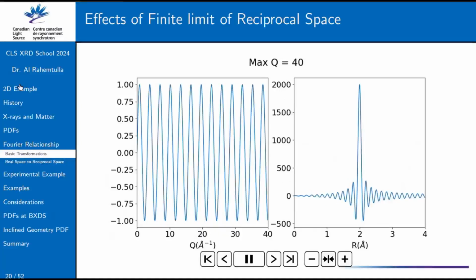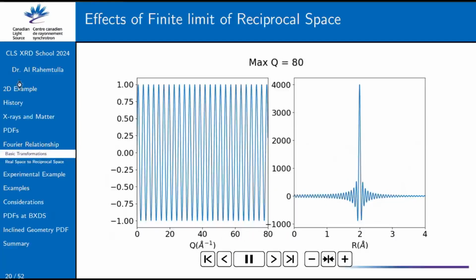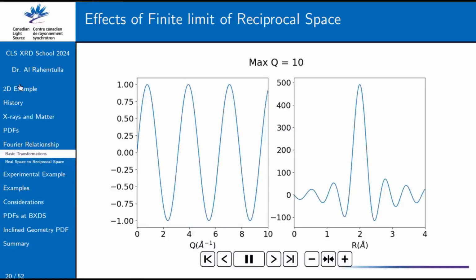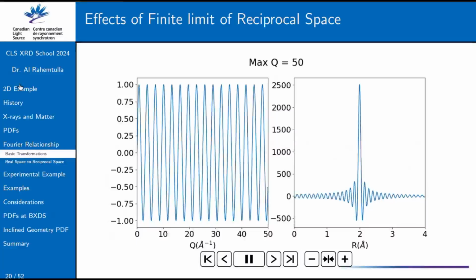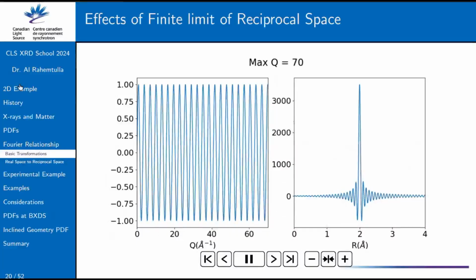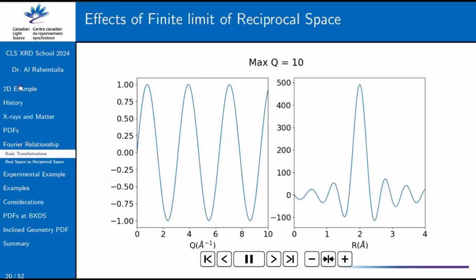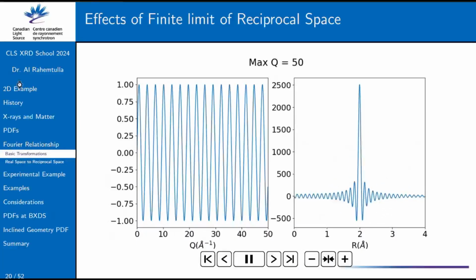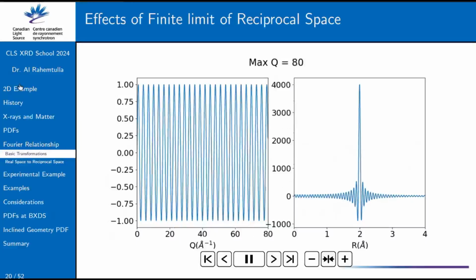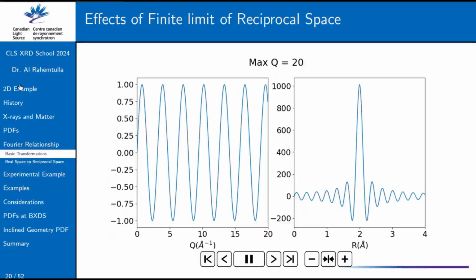I could add something to that too. As far as doing PDF on a lab diffractometer with a copper tube, your Qmax is going to be around 8, which is just too short. Your peaks will be super broad. People do it sometimes using a molybdenum or silver tube. With molybdenum, you can get a low resolution PDF. With silver, you can get a reasonable PDF. But with molybdenum the flux drops, and with silver the flux drops a lot.